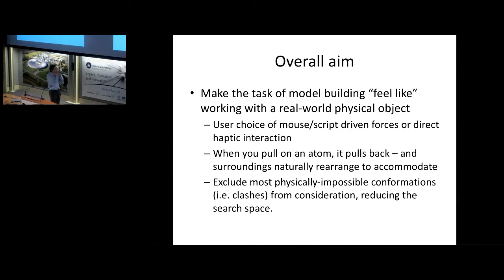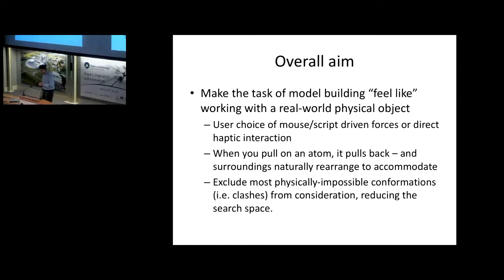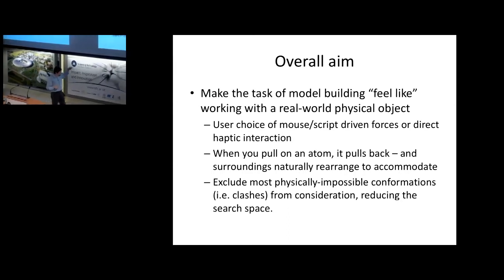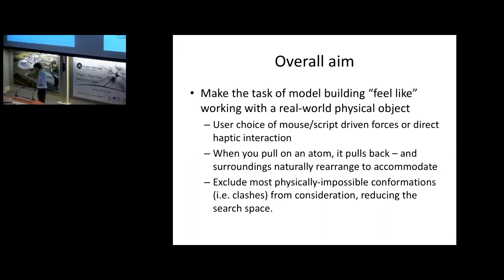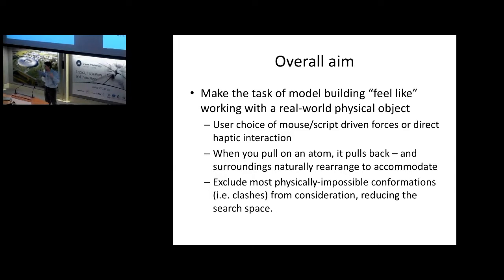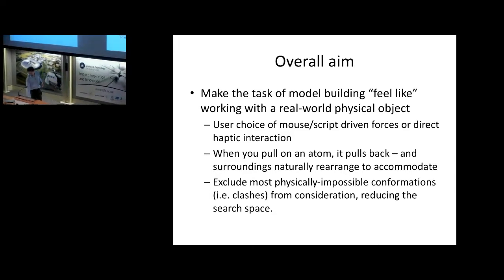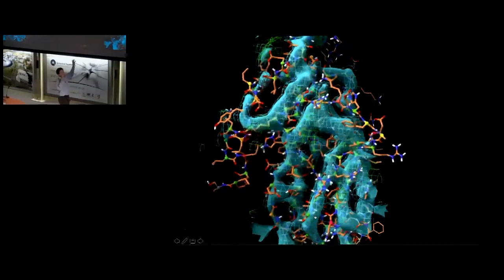Now, without much further ado, I'll show you an example of this in action. This was actually recorded on Sunday in my brand new environment. It's a repeat of the original insulin receptor job that started me on this, so it's cheating in a sense that I already knew where everything is meant to go, but I hope it will give you a good idea of how this is actually meant to work.